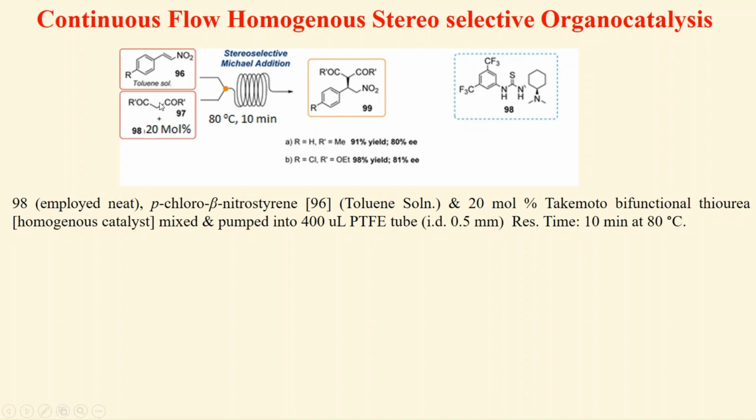Both were dissolved in diethyl malonate, and this Takemoto bifunctional thiourea is a choice of catalyst for Michael addition reaction, 1,3 dipolar addition reaction, cycloaddition reactions, and so on and so forth. This has been used in 20 mole percent concentration.